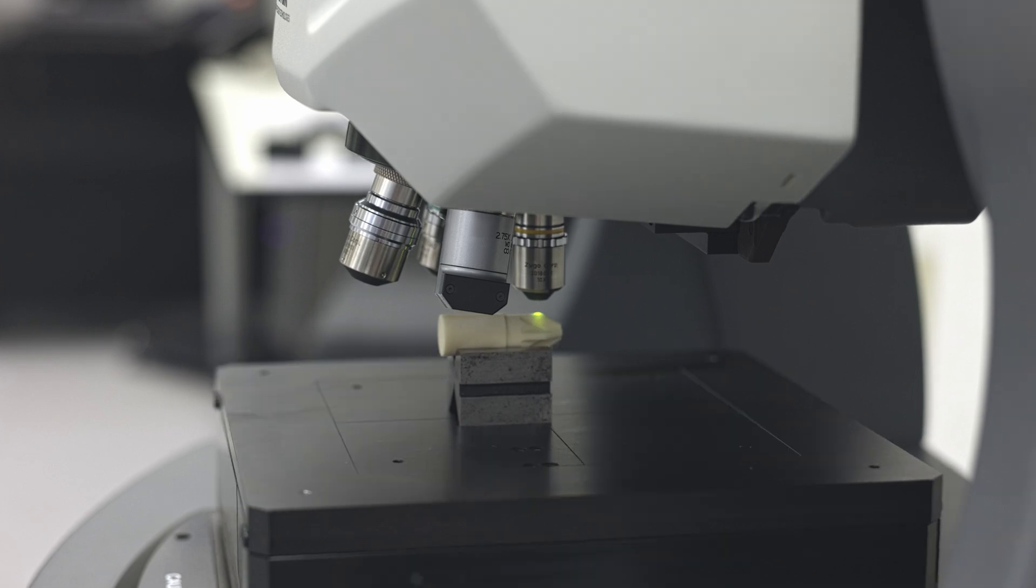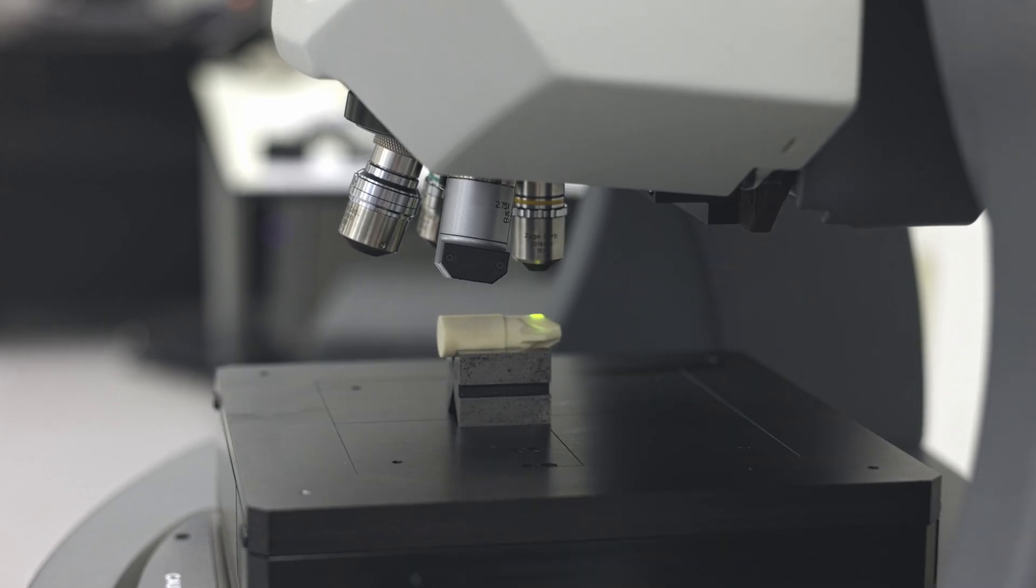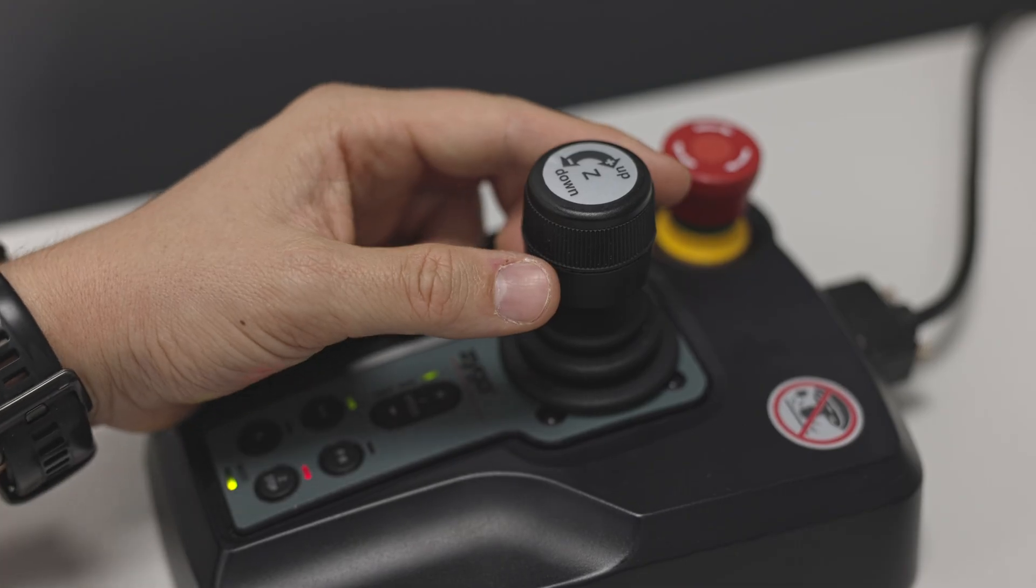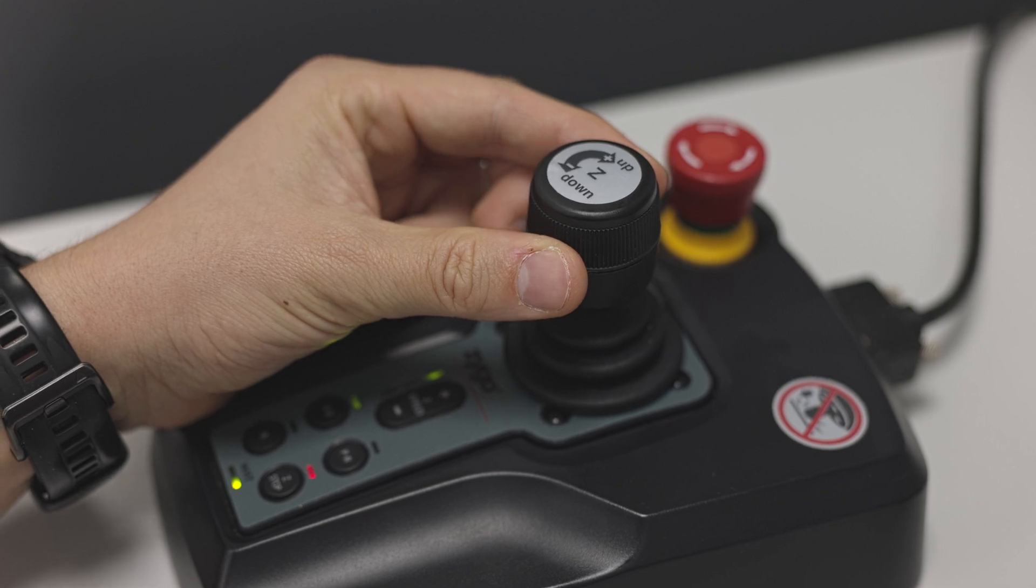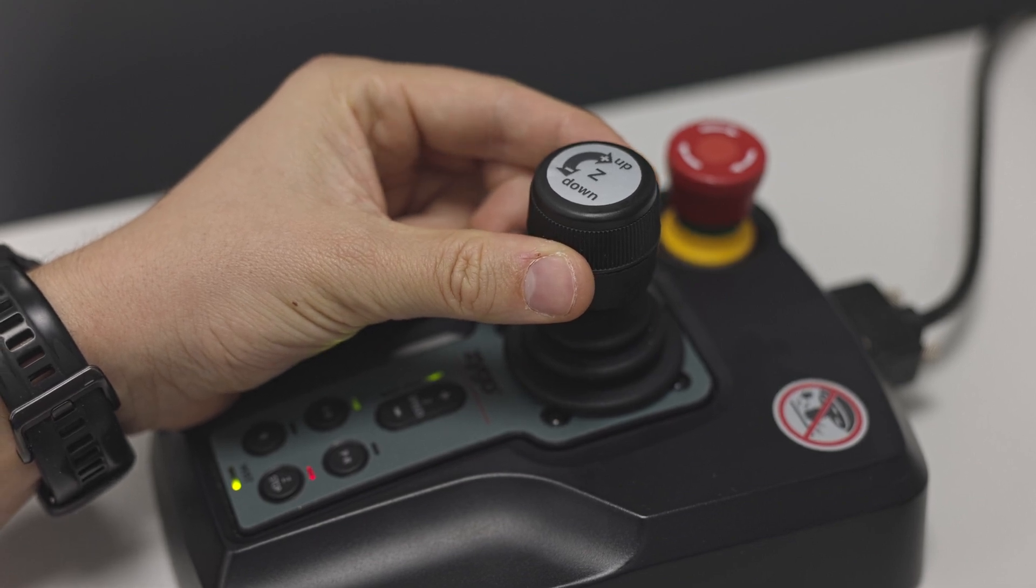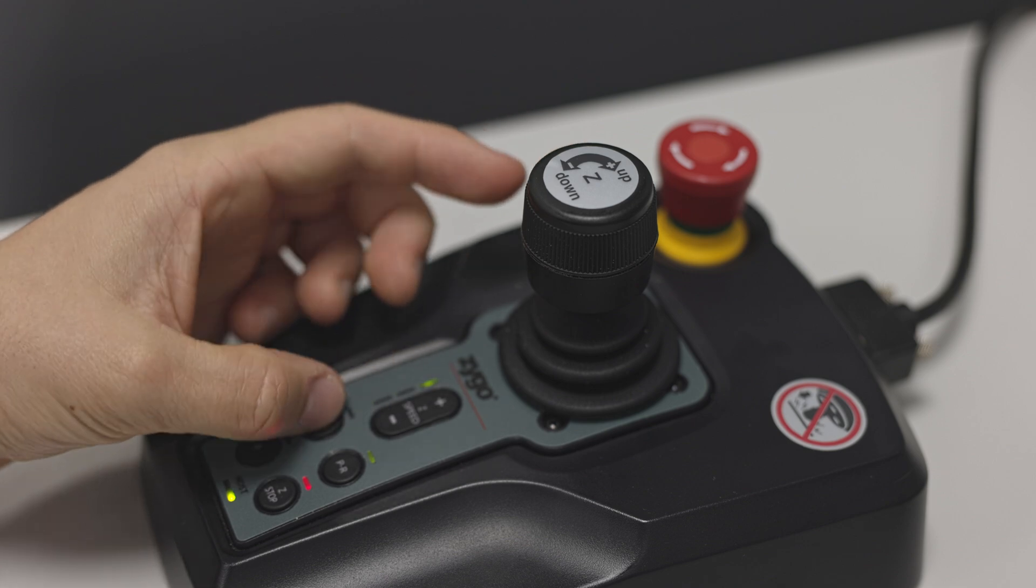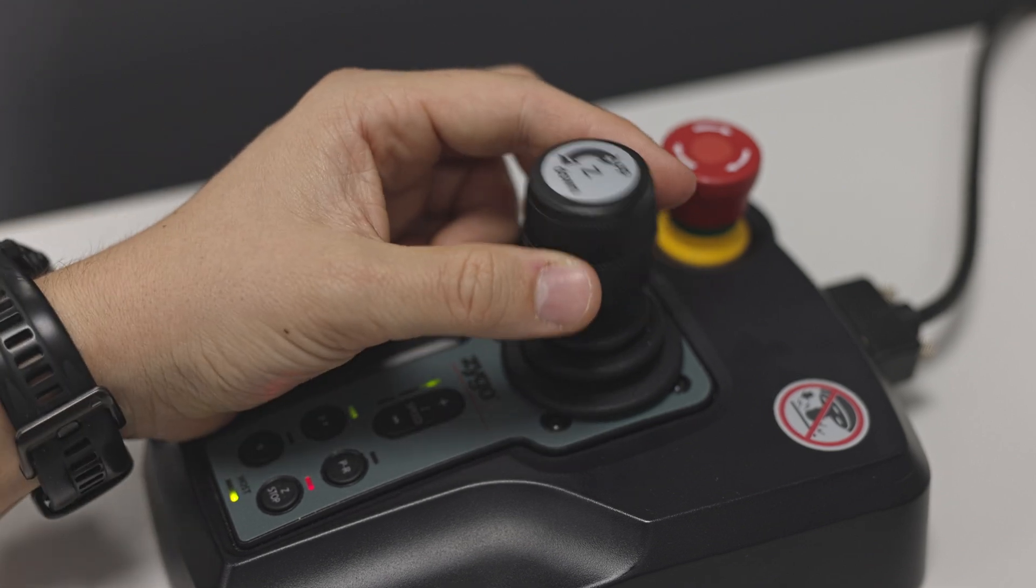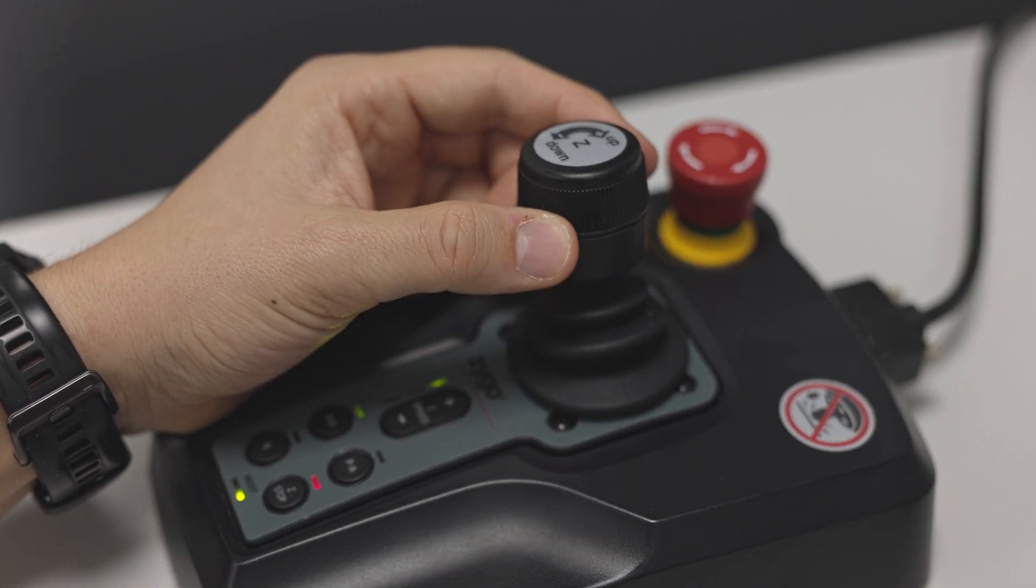For this, we'll use the totally red Zygon XView NX2. It's a super low noise, super high resolution white light interferometer. I don't believe there's anything better available on the market when you want to analyze surface roughness on manufactured parts.